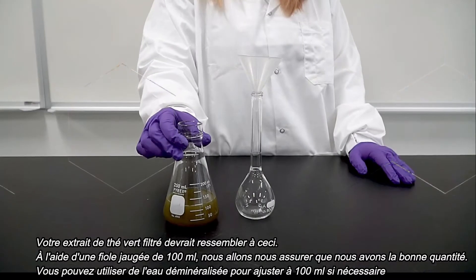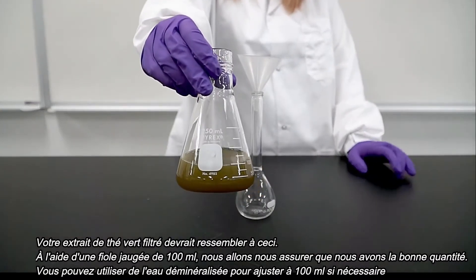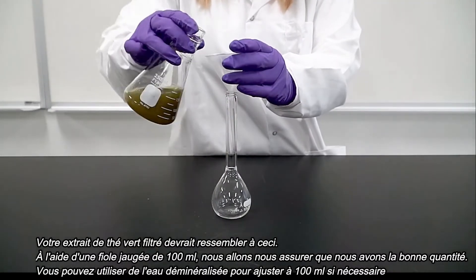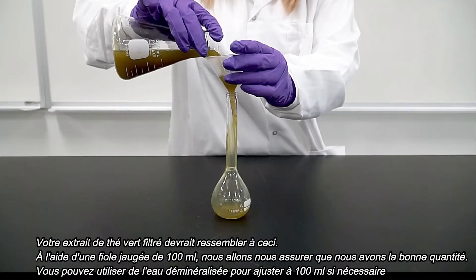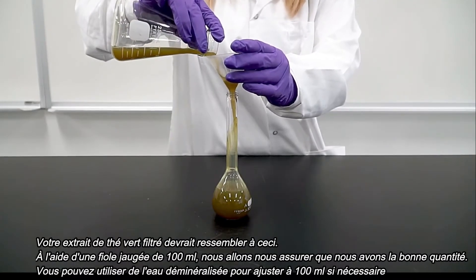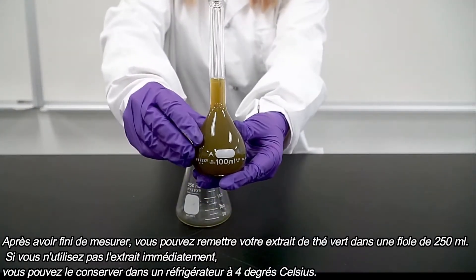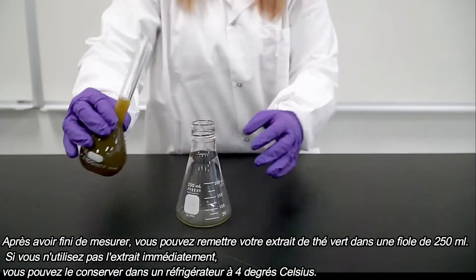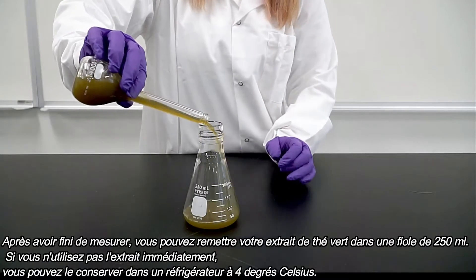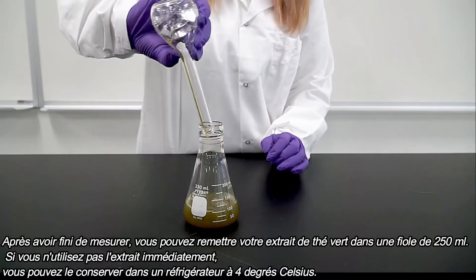Your finished filtered green tea extract should look something like this. Using a 100 milliliter volumetric flask we will ensure we have the correct amount. You can use DI water to adjust to 100 milliliters if needed. After you have finished measuring, you can place your green tea extract back into a 250 milliliter flask. If you are not using your extract immediately, you can store it in a refrigerator at 4 degrees Celsius.